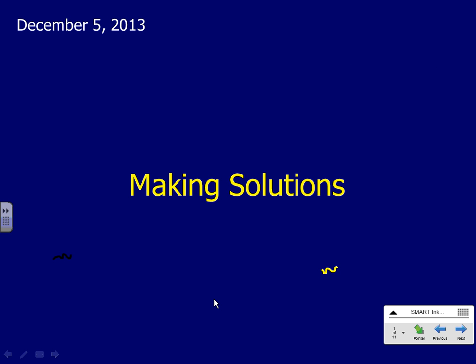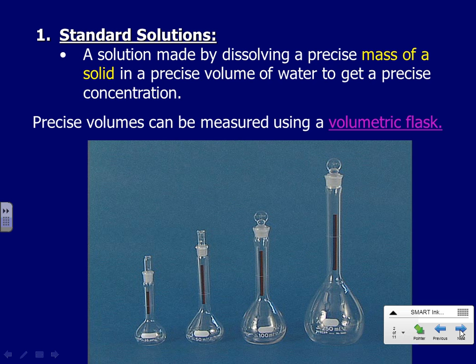Okay, so today we want to talk about how in a chemistry lab we would actually make solutions. There are two main ways we can make solutions.